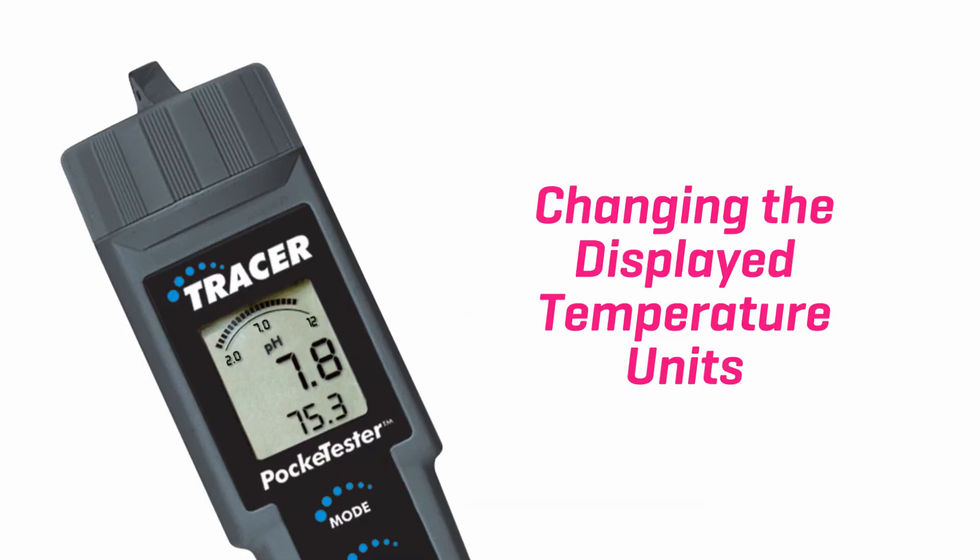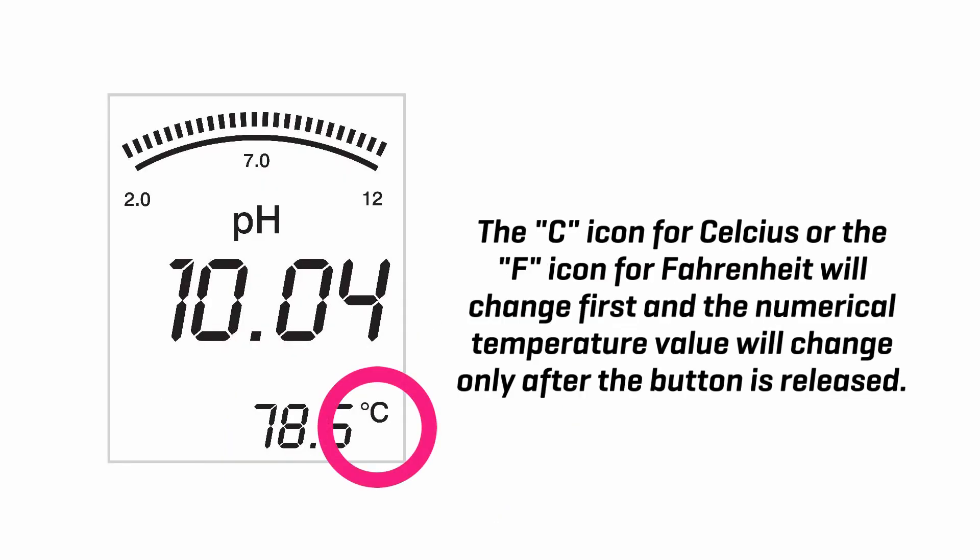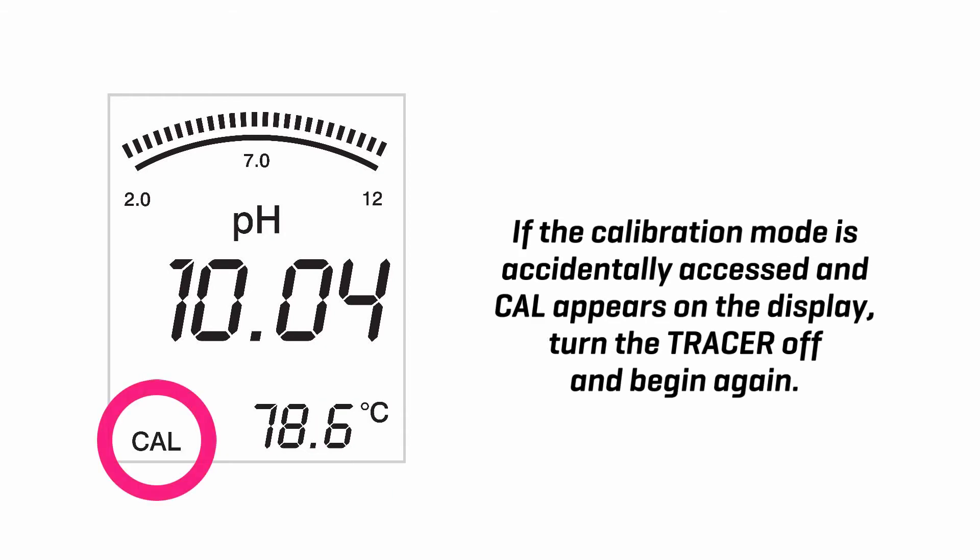Changing the displayed temperature units. Press and hold the cal button for approximately 3 seconds. The C icon for Celsius or the F icon for Fahrenheit will change first, and the numerical temperature value will change only after the button is released. If the calibration mode is accidentally accessed and cal appears on the display, turn the tracer off and begin again.